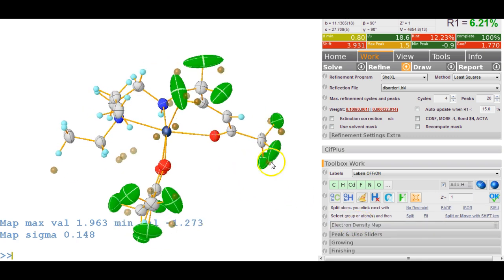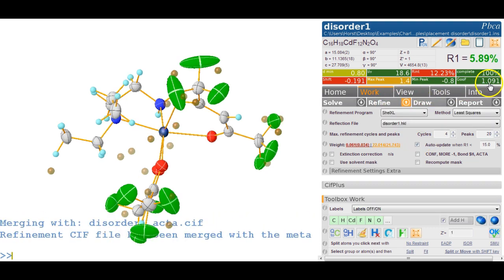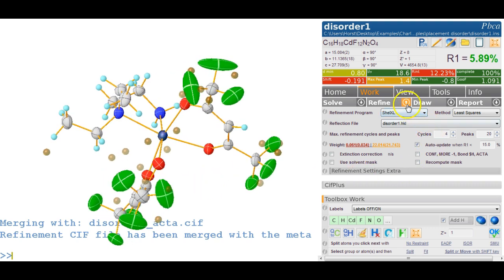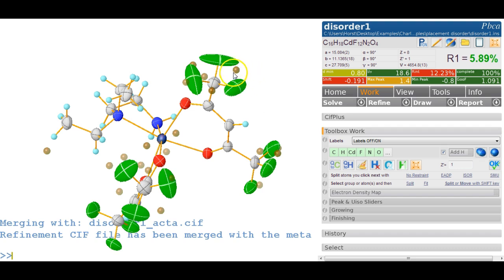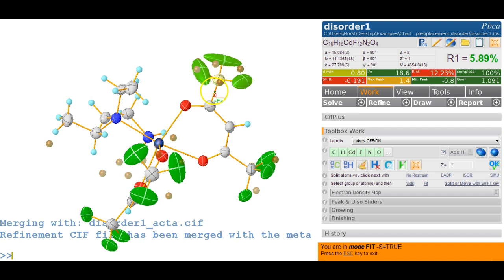Let's try and model that disorder. The goodness of fit is 1.7 - it's red because we haven't switched the weighting scheme on, so we click this button and refine to get it down. To model the disorder, we need to generate alternative fluorine positions. We select the group we're interested in, then from Toolbox Work select the Split function. We right-click on the axis around which we want to rotate, grab the fluorine, and turn it over.